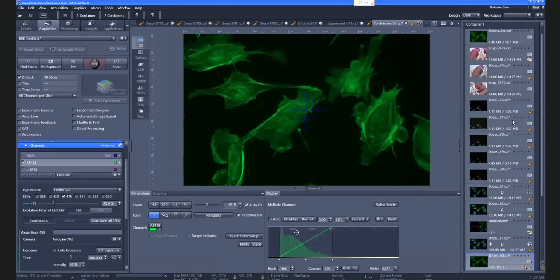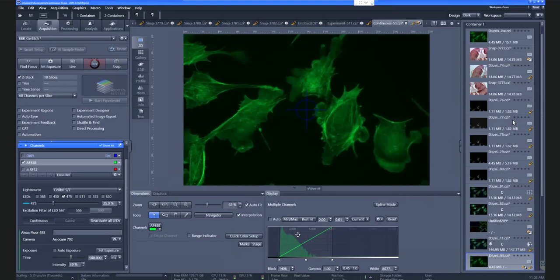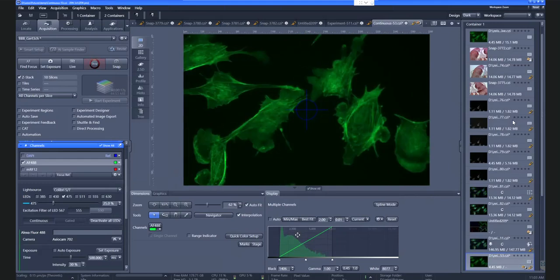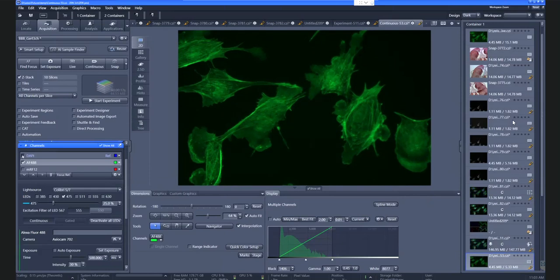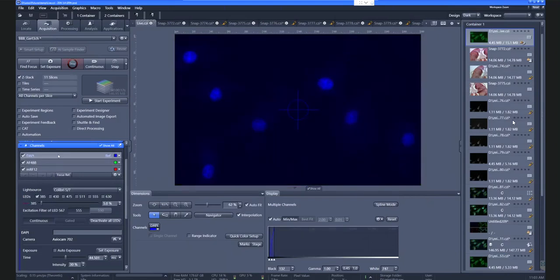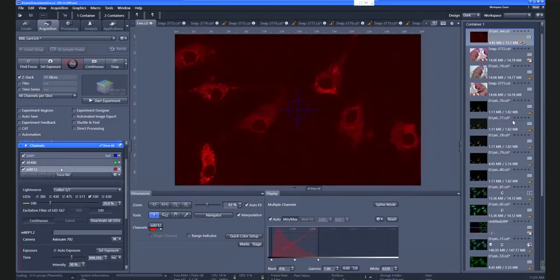And if I now move my sample, it looks a little bit weird, right? So it's not permanently updated. It's updated 3 times a second. And another difference is if you are in live mode, that's why I mostly use live mode, you can quickly switch between those channels and you get quickly updated, and that's it, and you protect your sample and so on.